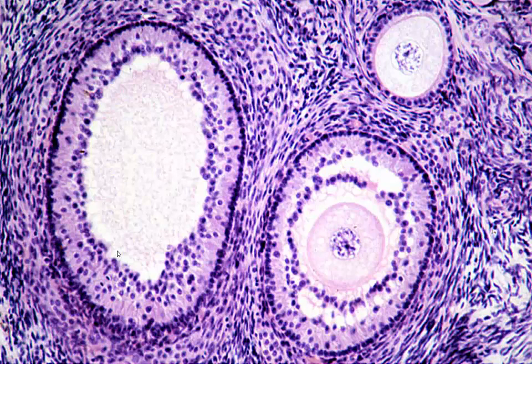This is just a higher magnification look at the follicles that we saw before. Again, the antrum. Many of these spaces are going to coalesce into the single large antrum, so secondary follicle. Here we have one layer, so we can see that a little bit better. So that is a unilaminar primary follicle. And we don't see the oocyte present here, but since we have this large fluid-filled space, then it's going to be a secondary as well.